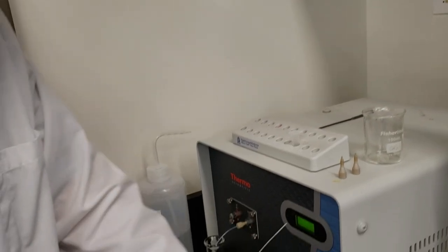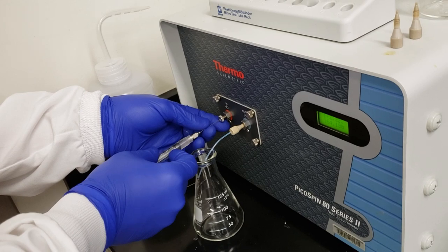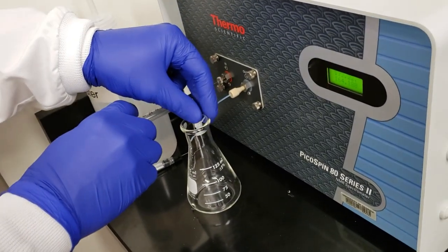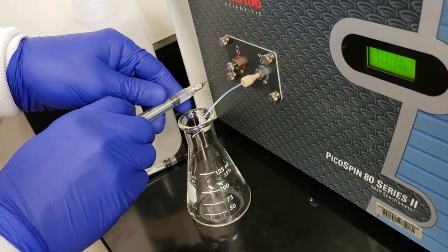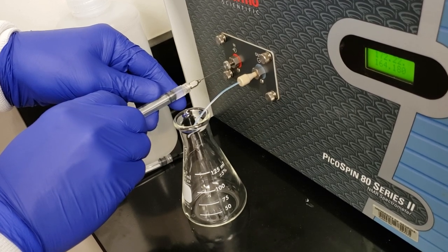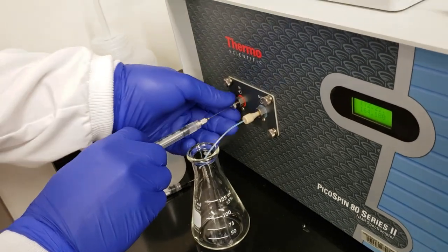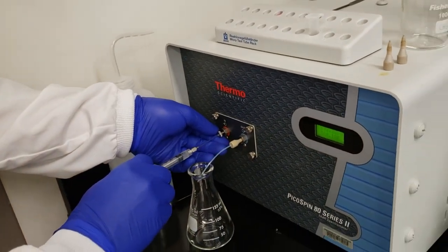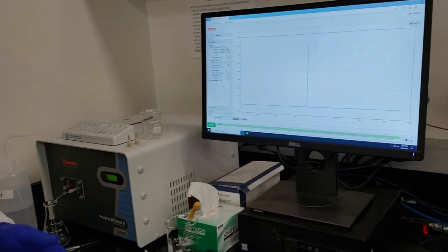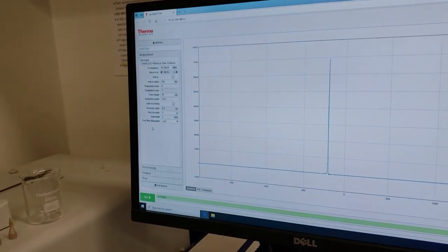And we're good. So we're ready to inject. Loosen my inlet. Insert the needle. Tighten the inlet down. And I'm looking for 10 drops coming out of my outlet hose here. And it can be more than 10 drops. We just want to make sure that we get our loop filled with the sample that we want to analyze. So I'll loosen my inlet, tighten it back down, and we're ready to start our scans. We've got this set to 8 scans. So I'll go ahead and hit go.